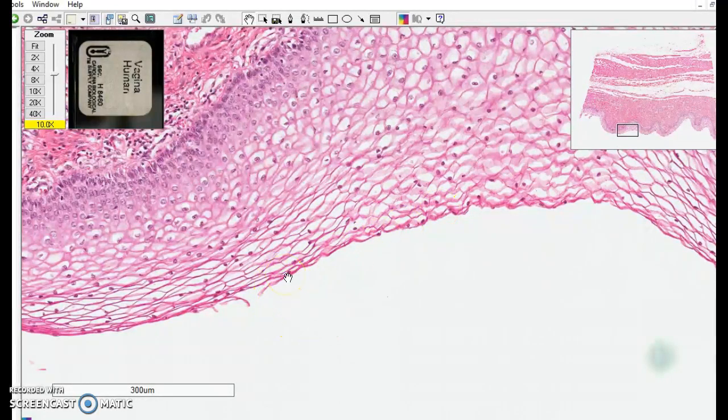This is different than the keratinized type because as the cells die in keratinized epithelium, they become more compact. Those tough keratin bundles bind together and stay as little flakes at the body surface. Here the cells die off and get scraped away individually, so you'll see more of these empty cells than you would see in keratinized stratified squamous epithelium.